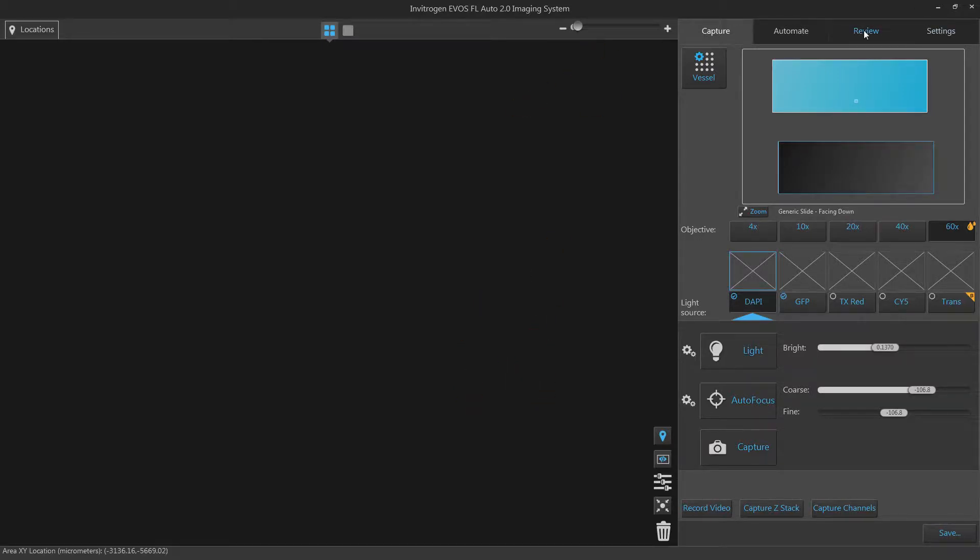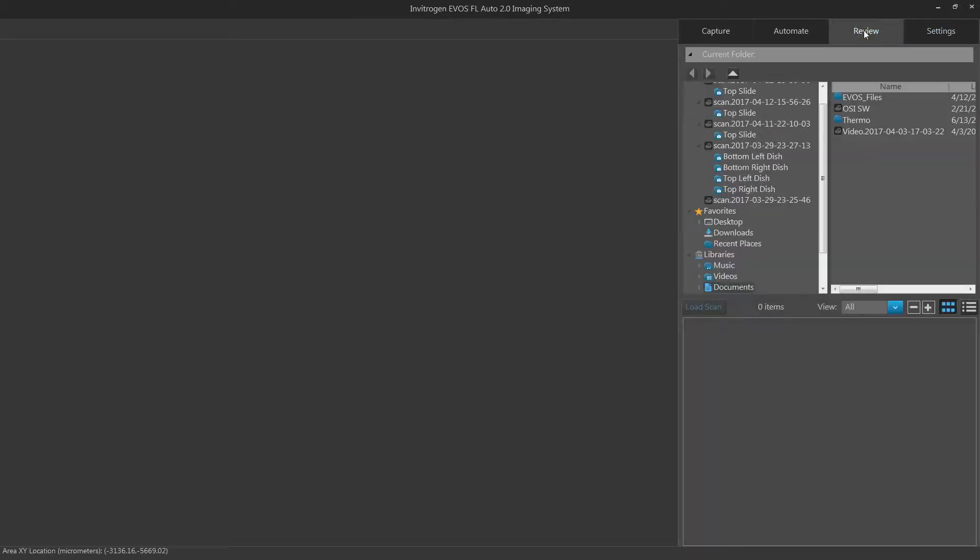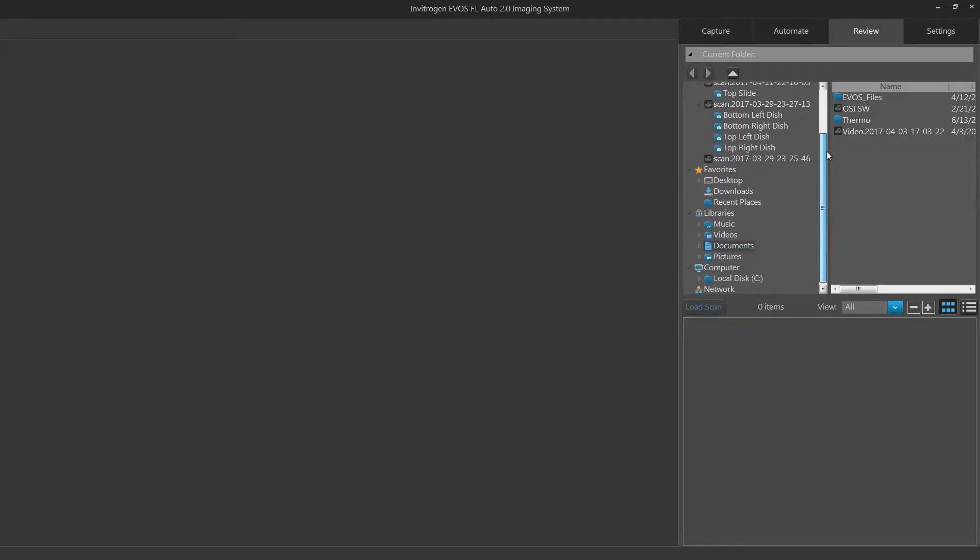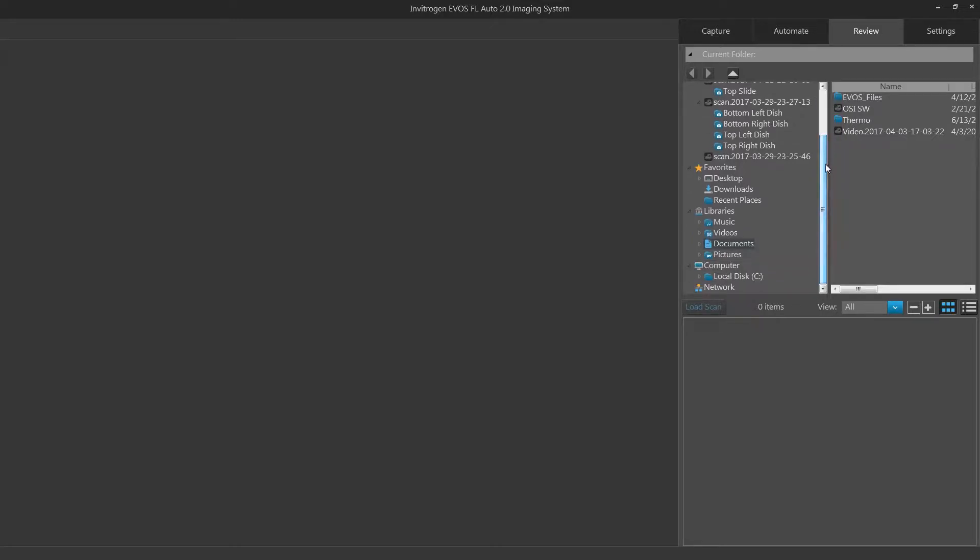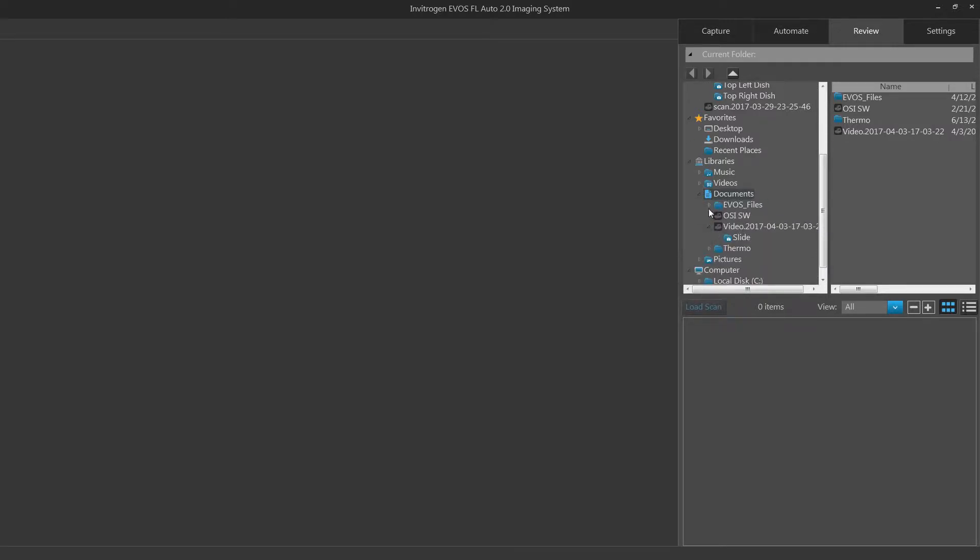These images may be reviewed within the review tab. Clicking the review tab will bring up your review menu. Here you can navigate to your saved location for your previous image. Use the navigation window on the right side of your screen to find your saved location.